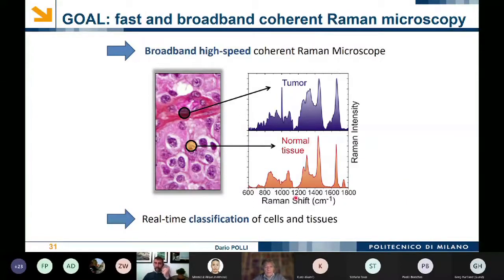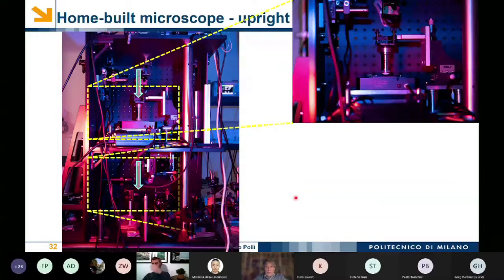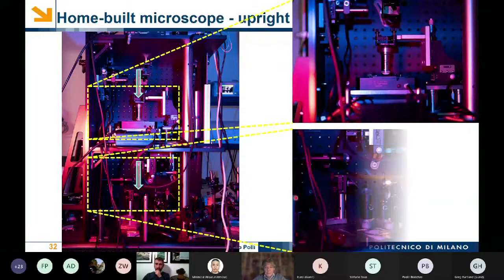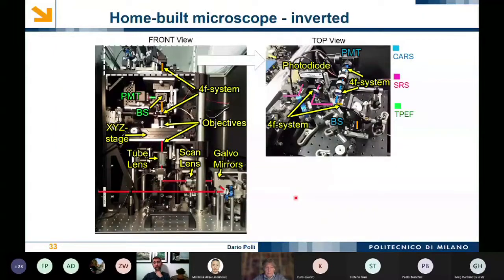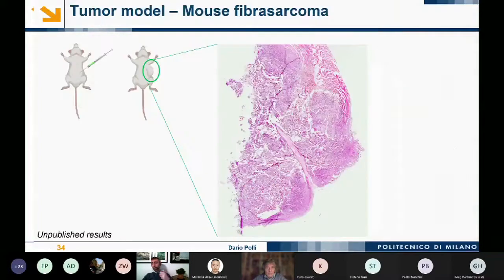Let me show a couple of images of our instruments. This is a home-built upright microscope where light travels from top to bottom, with a zoom of the focusing and collection parts. This is a home-built inverted microscope where light goes bottom to top, with galvanometric mirrors for fast scanning and transmission detection using both a photomultiplier tube and a balanced photodiode. This is a multimodal microscope detecting simultaneously two-photon excited fluorescence, second harmonic generation, CARS, and SRS.